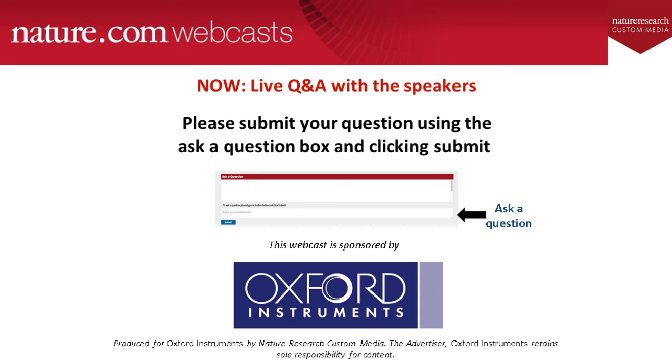Excellent. Thanks, Erin. Our next question, I think, is something that you've touched upon briefly before. It asks, is it possible to use a sample prepared for TEM or SEM for benchtop microscopic X-ray fluorescence spectroscopy analysis? Louise, is that something you can help answer?